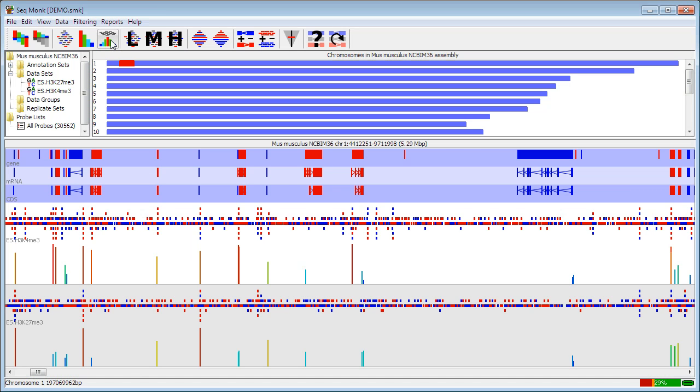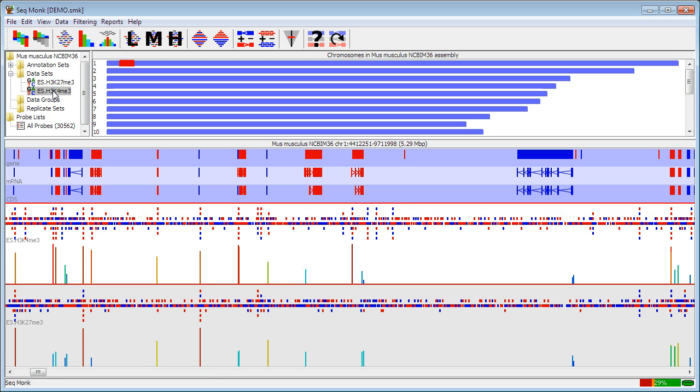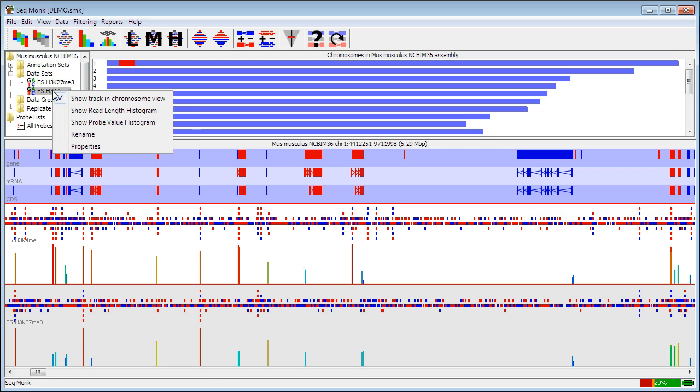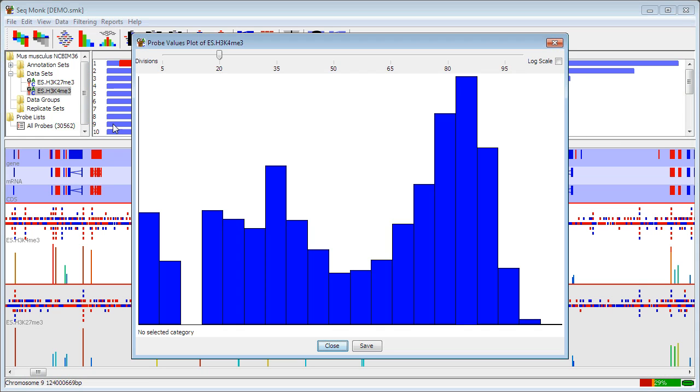Now that I've quantitated my data I can actually look at some views of this quantitation to see what's going on in my samples. Probably the most useful initial view is to look at the distribution of quantitative values within one data set. This applies to data sets, data groups or replicate sets. So to do this all I need to do is to select the data set I want to view, right mouse click on it and say show probe value histogram and that will plot out a histogram of all the values that are associated with the currently active probe list.